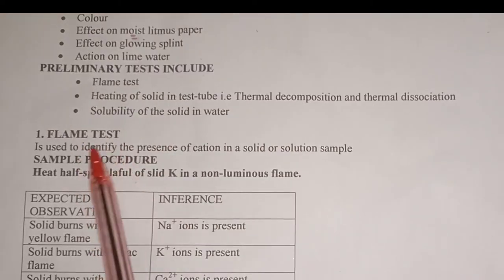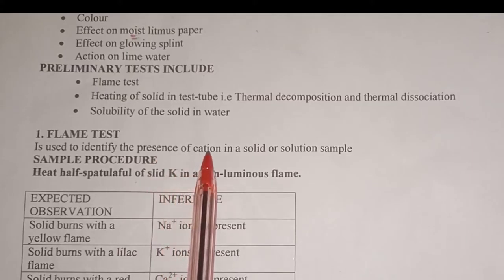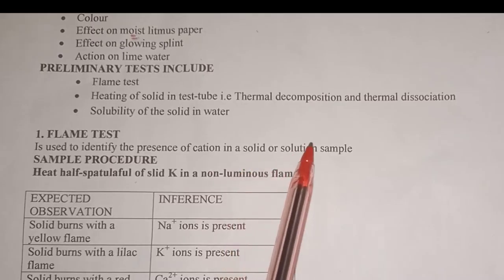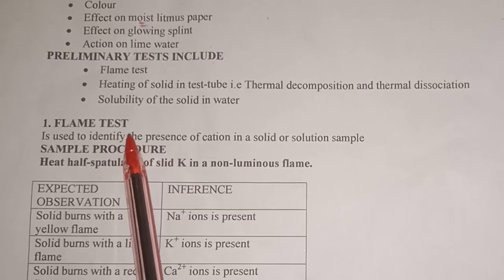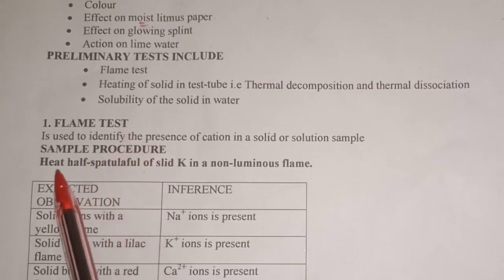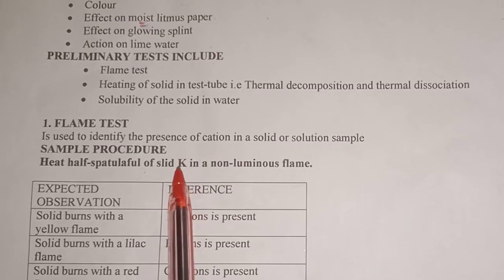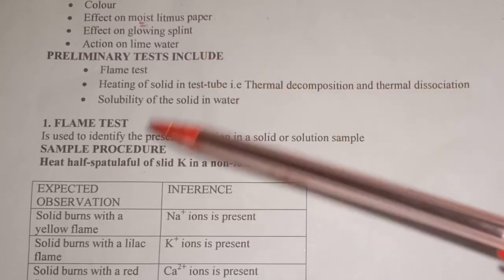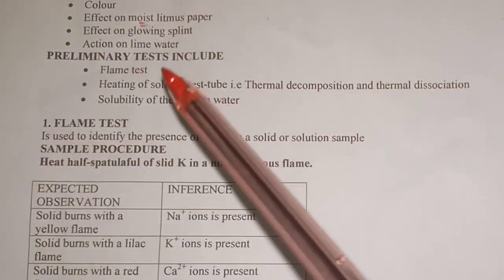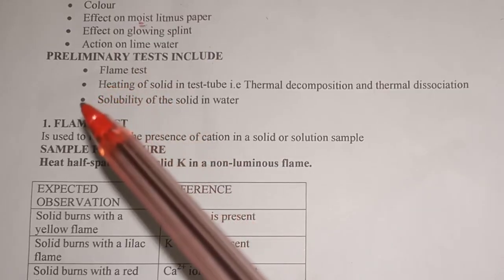Now, to start with the flame test, this one is usually used to identify the presence of a cation. Cation means a positively charged particle in a solid or a solution sample. A flame test is usually done by using a spatula, or you can use a nichrome wire. The procedure is you heat a half spatula full of solid K, just an example, using a non-luminous flame. So you scoop the solid using a spatula, and then you heat it using a non-luminous flame. The observation that you make is the flame test.